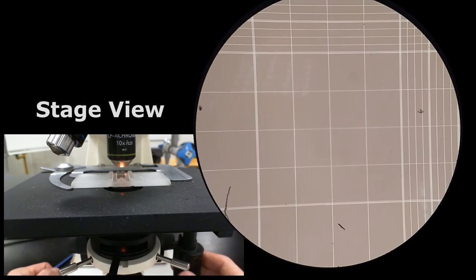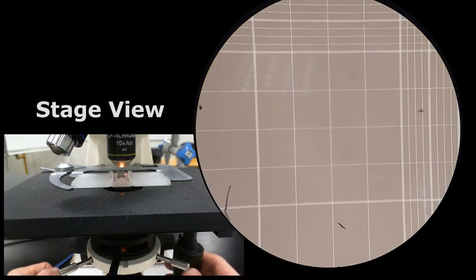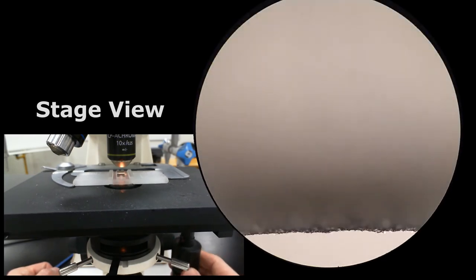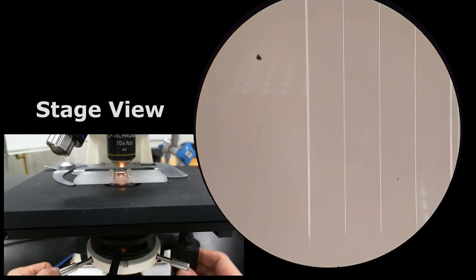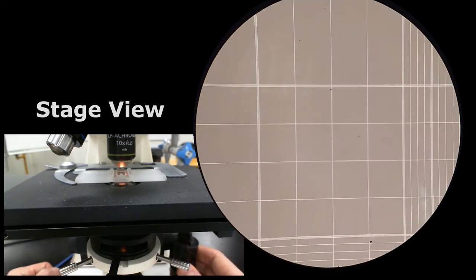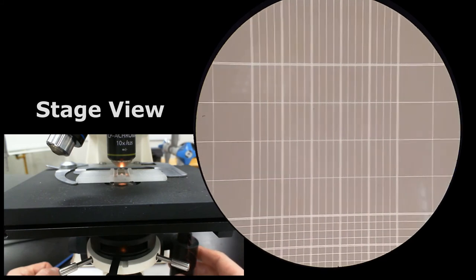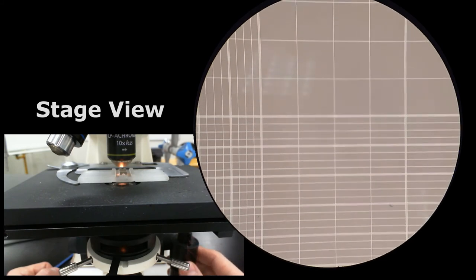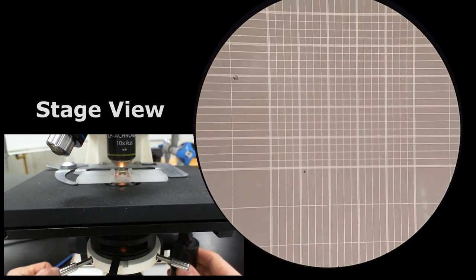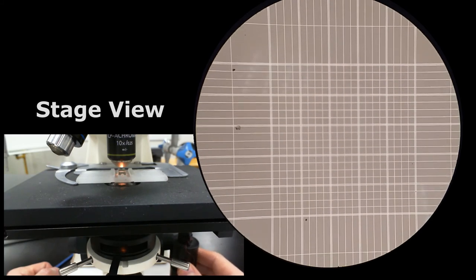And then you will move on to the next counting chamber. So I'm going to go across the division between the two counting chambers, and here's the second counting chamber. And again, count the cells in here, in here, and then the middle large square.